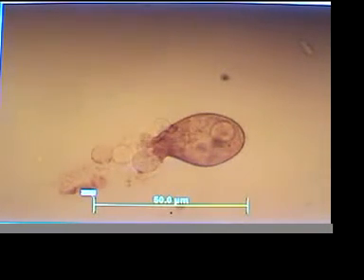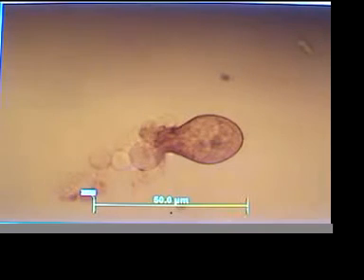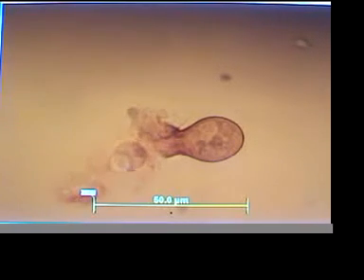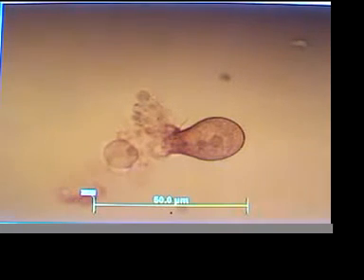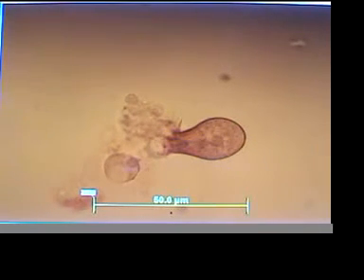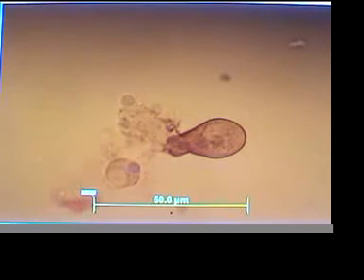Devitalization of Blepharisma in real time. Watch carefully. Dramatic changing of the shape of the organism. This experiment's important because this is being done with a grid slide. In fact, it's my first grid slide, so I'm a little inexperienced in calling out the grid locations for these things.